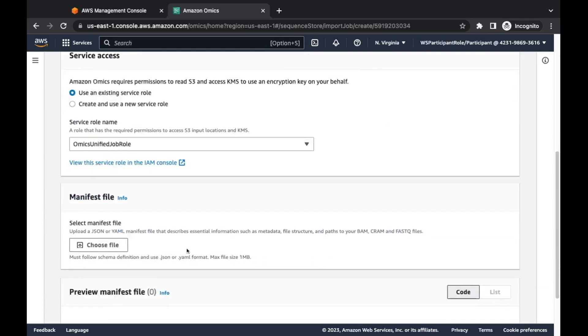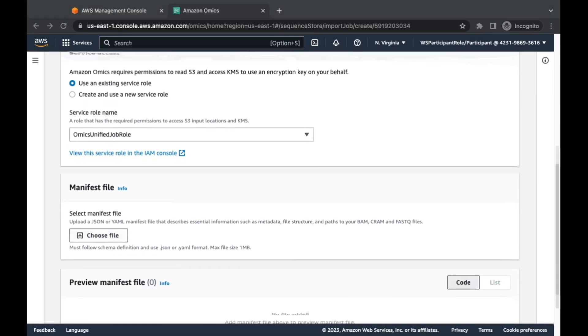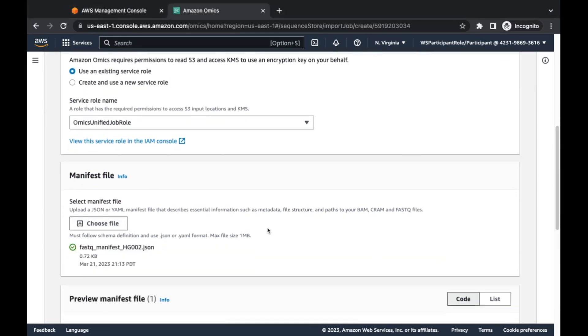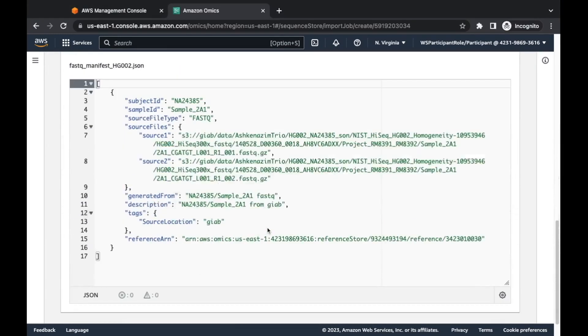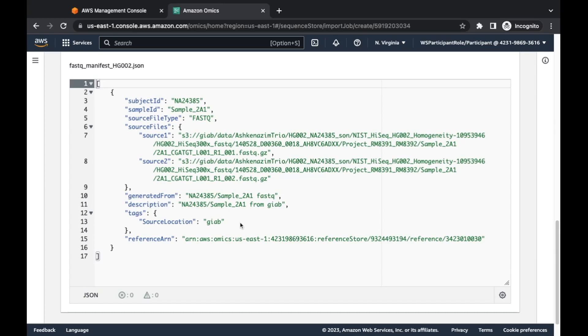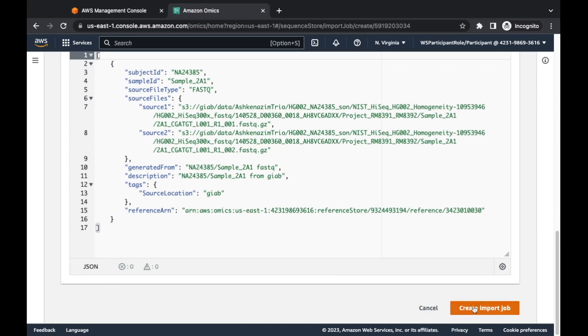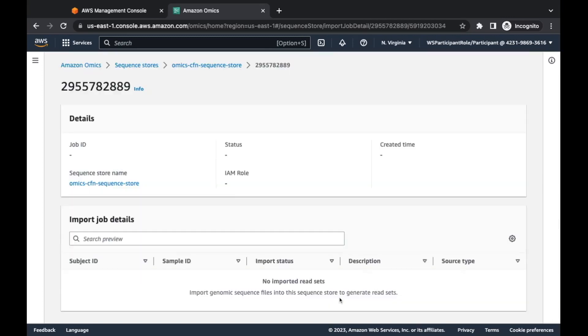I've already got a sequence store created. If I click on this, I've got a sample imported here, but I'm going to import another one just to show you what the process is like. So we're going to click on this button here called import genomic files. And here we'll see this is where references come into play. I've now got two references in here, HG38 and HG19. Same idea, this is going to be a service role that says I have access to the data that you want me to fetch and pull into the sequence store.